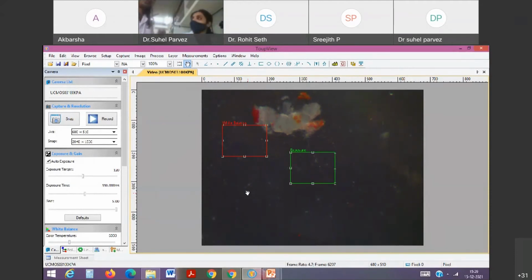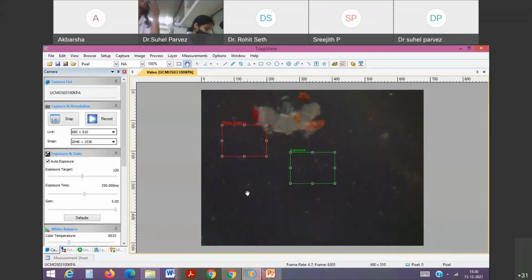So this is all we do in the lab with Drosophila. I'm working on the neurotoxicity of pesticides on wild type Drosophila, and my work will proceed to transgenic models of neurodegenerative disease. We are interested in the PD model, and my colleague Sabah is working on the AD, Alzheimer's disease model. Does anybody have questions?